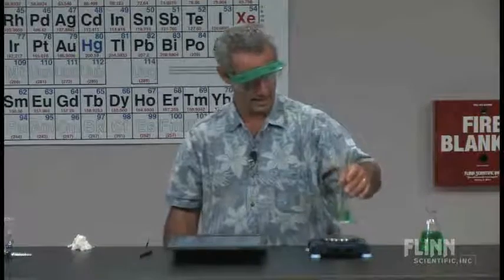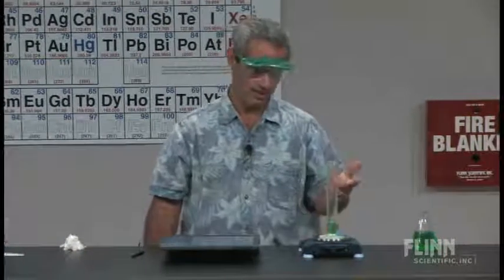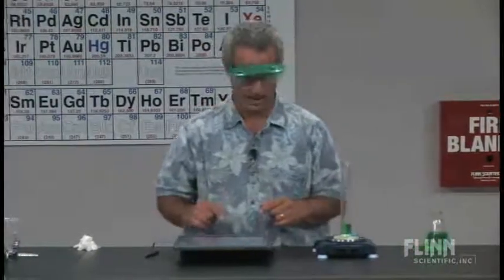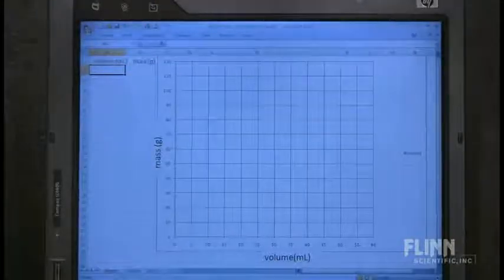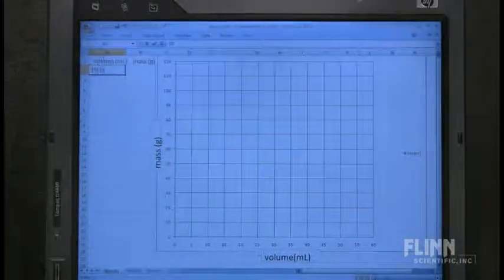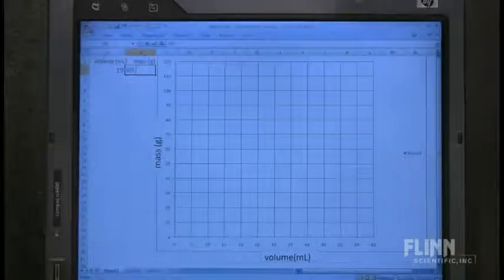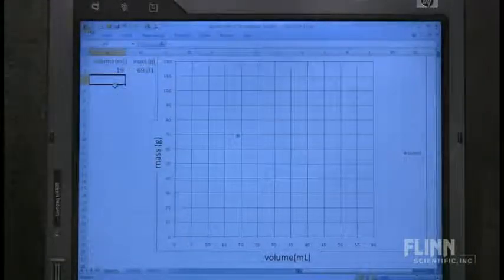I'm going to put that on the scale — 69.01 grams. I'll enter that into my Excel spreadsheet. Volume was 19.0 and mass was 69.01. The decimal won't really make a difference. Now we're going to go to our next data line.